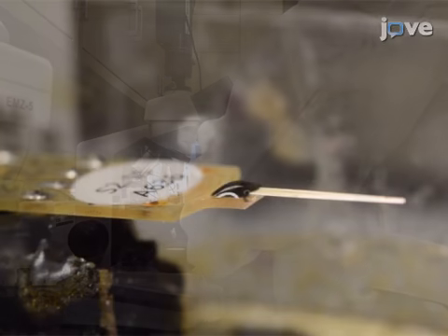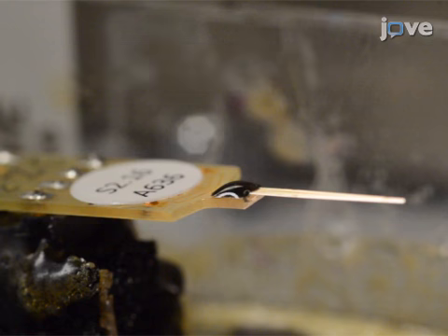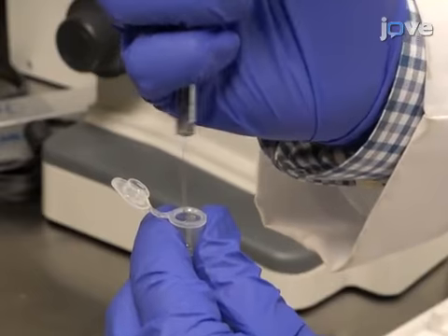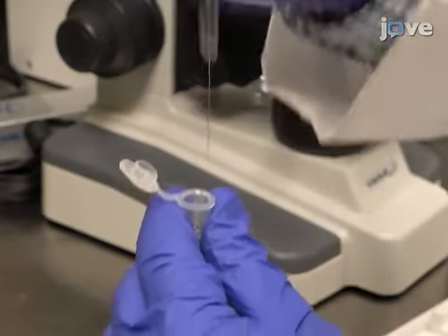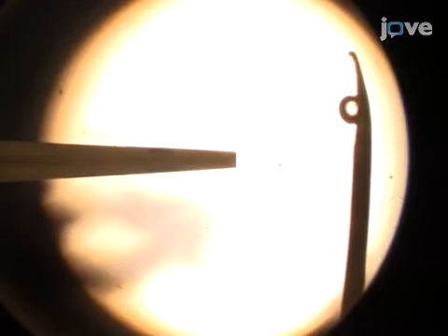To begin this procedure, coat a pair of recording sites on an MEA with the desired enzyme and a different pair of recording sites with the inactive protein matrix. Then, draw up the glutamate oxidase or protein matrix using a 10 µL Hamilton syringe. Gently press the plunger to dispense a small bead of solution at the syringe tip.